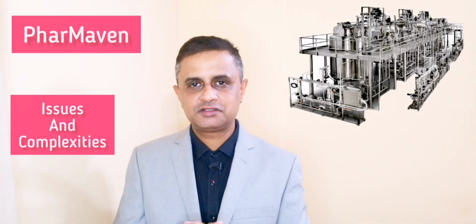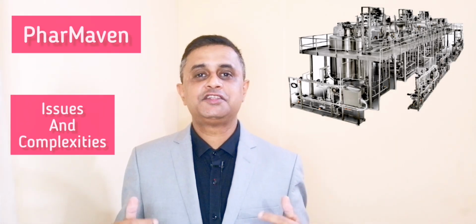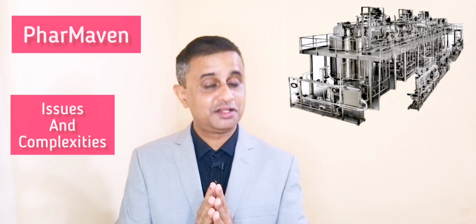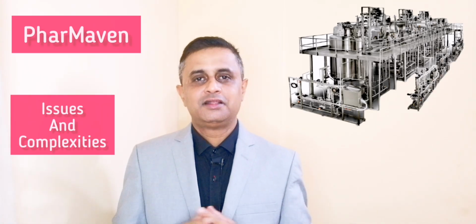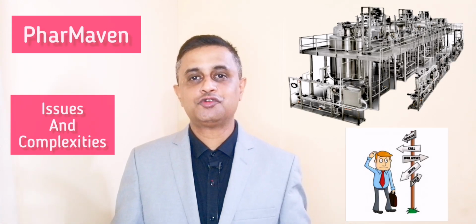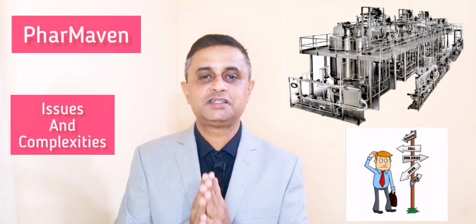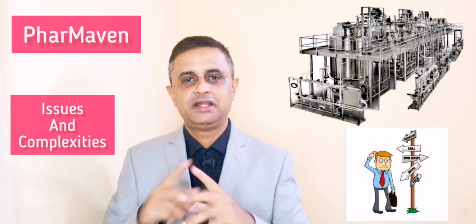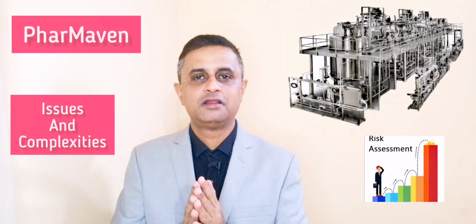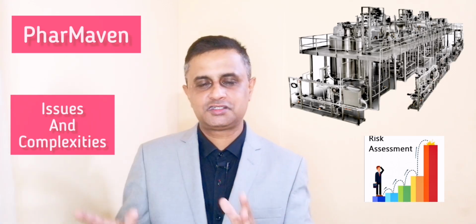Why? Because of the complexity or the issues which may arise during your routine process, if you have not done the water trials, or placebo trials simulating the product, there are chances that you will find surprises during the media fill, which can lead to media fill failure. If such surprises arise during the media fill, it will be a black spot in your system that you had a media fill failure. So to avoid that, please conduct a water trial with the system.